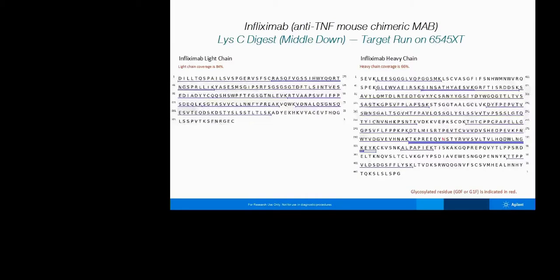And we're going to focus on the glycosylated peptide, which Rebecca was just showing you, being done with trypsin digests. Here we're working on much larger fragments.